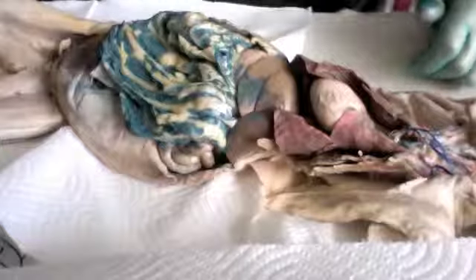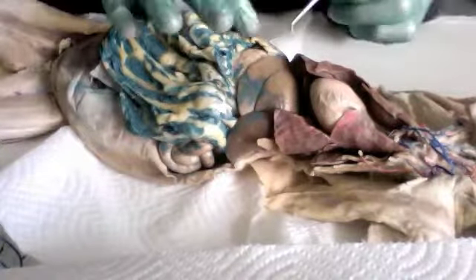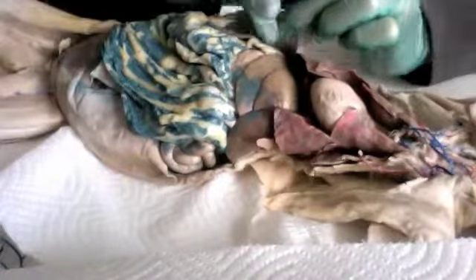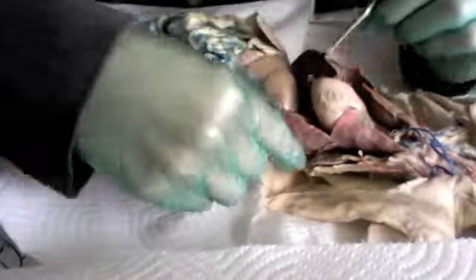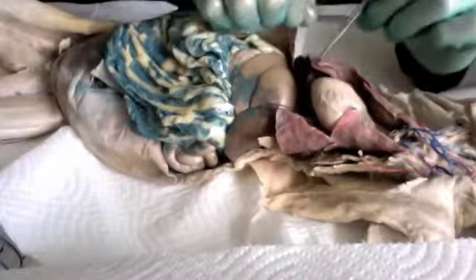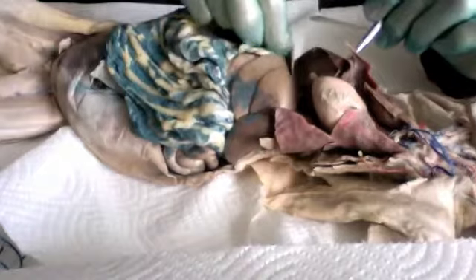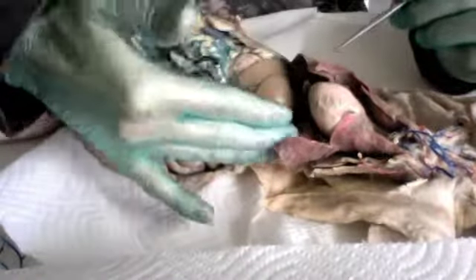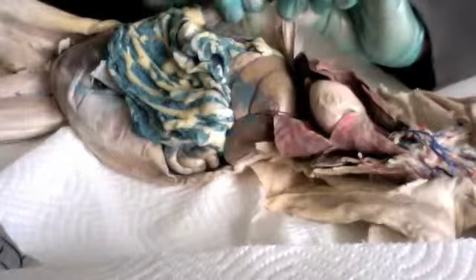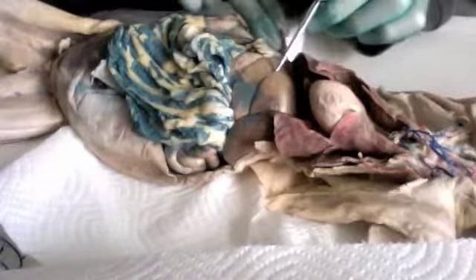Okay, first we have the diaphragm of the cat, and this is for the abdominal pelvic organs. I cut the rest of the diaphragm so I can get in everywhere, but you can still see it. The diaphragm runs right over the liver. It's like a sheet that runs right along here. You can still see some of it left over right here. This is the diaphragm. And then we have the liver here.